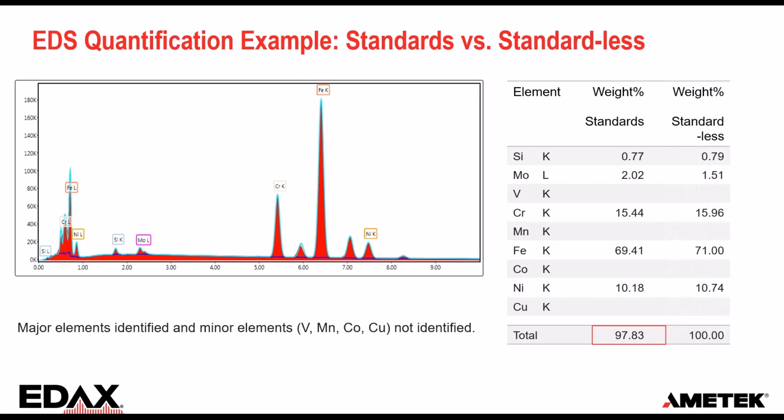And due to the normalization, the remaining elements in the normalized quantification still scale to 100%, but the proportions have changed for each element. Even though in this case the differences might appear relatively small, the misidentification of one, or in this case 4 elements, causes additional error on all the other identified elements.